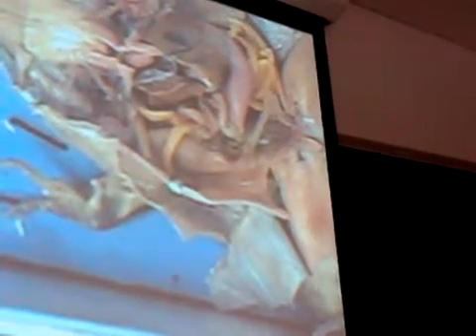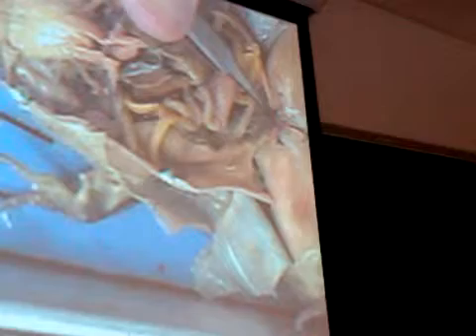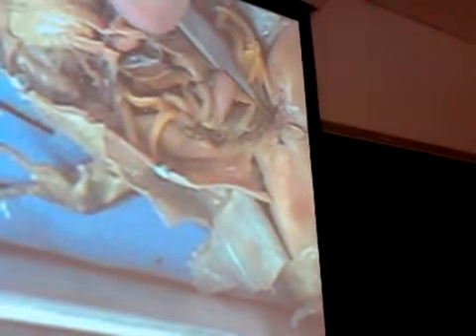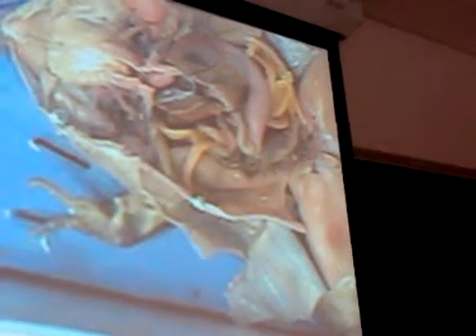Obviously, if the animal was alive, it would be filled with urine, right? Now, there's no distinct separation between excretory system and reproductive, as far as the products get dumped into a common chamber called the cloaca. Here, if you follow this probe down, is the cloaca. So it goes into there and obviously leads to the anus. So reproductive and excretory products get dumped in these lower vertebrates into a common chamber called the cloaca.